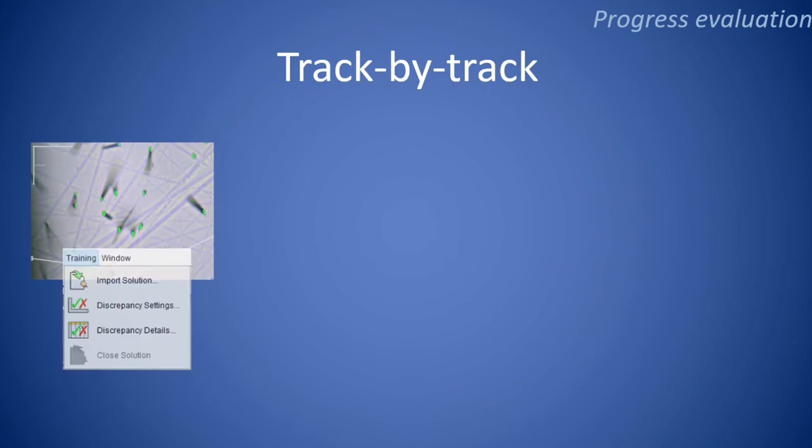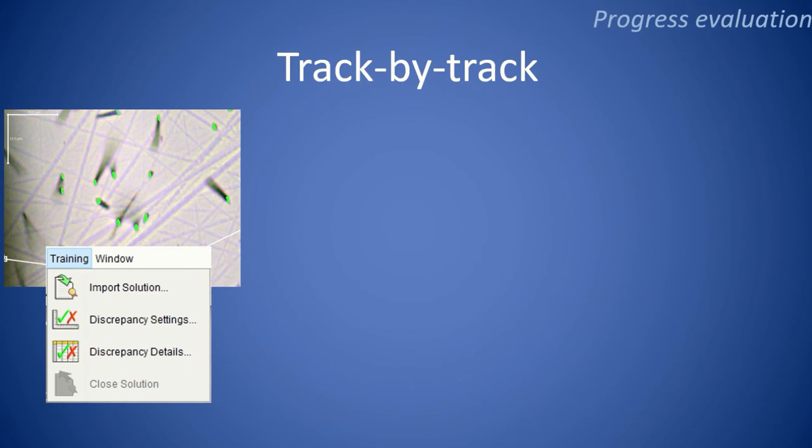And after all the hard work, trainees can compare their manually corrected data with solutions provided in the module, simply by loading the solution file to FastTracks using a new addition available in FastTracks version 3, the training mode.